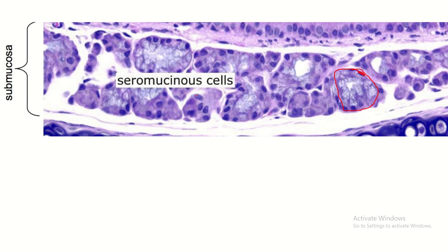This is the serous acinus. The acini take up more stain than the mucous acini. The nuclei are oval and present in the center of the cell because the secretion is watery, so the nucleus is not pushed basally.